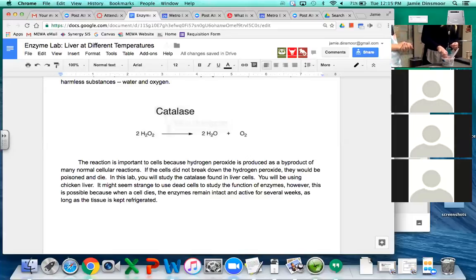Yum. Who doesn't like liver? But look at how big this is. Think about how big chickens are. They're not that big. This is huge. Livers are big. They take up almost the entire inside of you. See, I'm surprised no one's making any comments. The last thing someone said was hot, and not about the livers. Okay, here we go. Start chopping away.